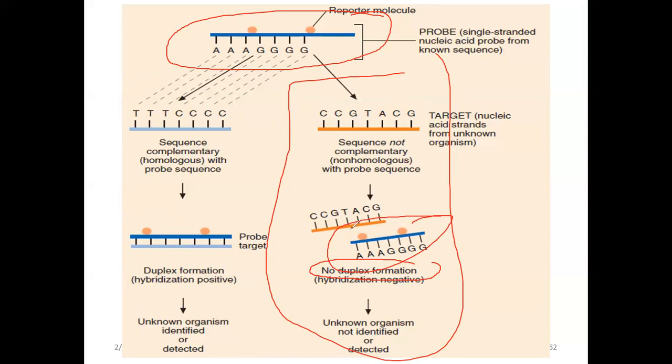Okay? Kasi hindi naman pala present si 0157, yung organism, for example, na yon. Okay? Or yung target mo na hinahanap na nucleic acid sequence. Okay? So if you view the result dun sa microscope, wala kang makikita. Negative. Okay? So that's for your hybridization.